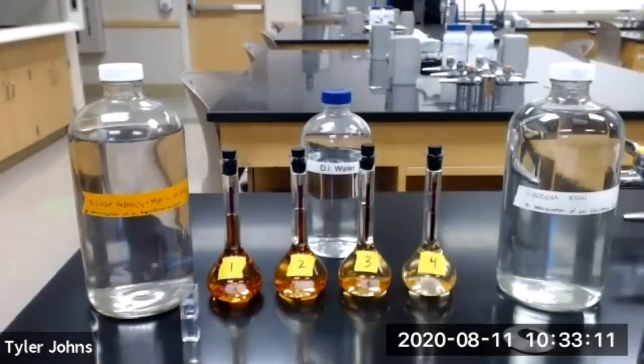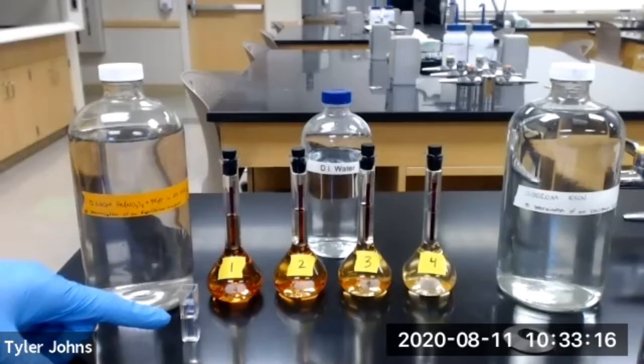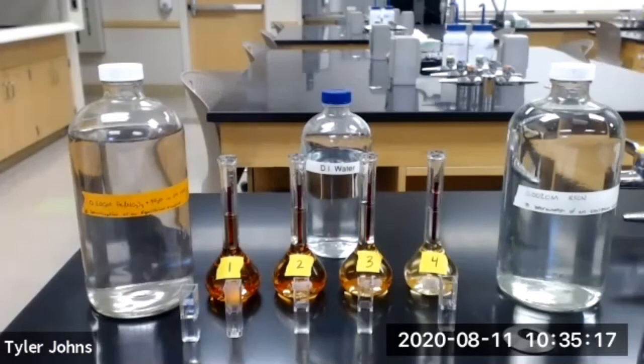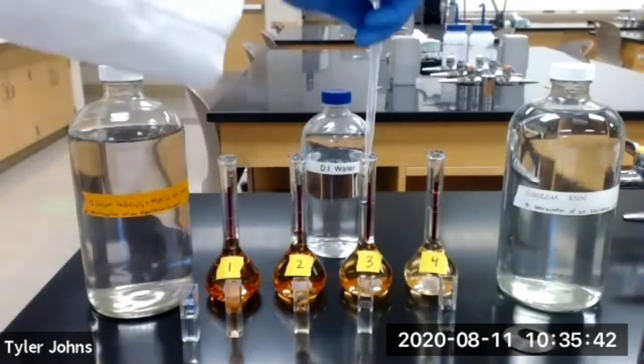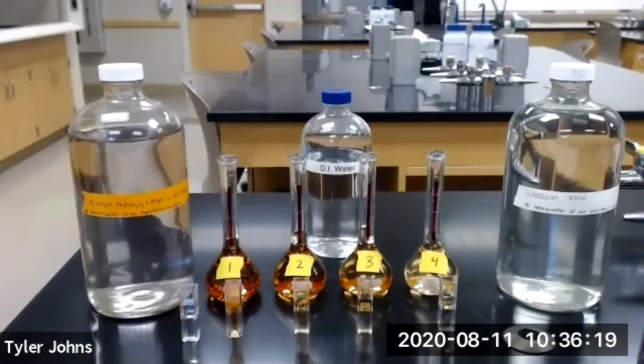We also need to prepare a blank for our spectrophotometer by filling a cuvette with 1 milliliter of deionized water. We'll now transfer 1 milliliter of each of our standard solutions to a corresponding cuvette. Our standard solutions are now ready to be read in the spectrophotometer.